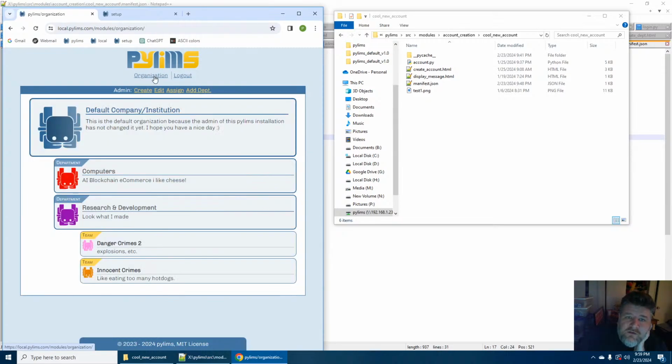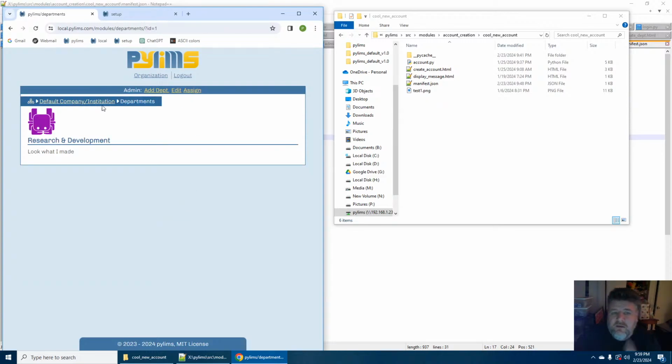And the whole idea of it is to be really fast and customizable. So these are going to be very basic examples that you can kind of get away with, and then either other people or I will develop more complicated and more robust things later. But there's obviously a lot of bugs in this still. I just kind of wanted to make a video since I have not done it in a while, just kind of keep myself motivated. And yeah, so that's what I have so far.